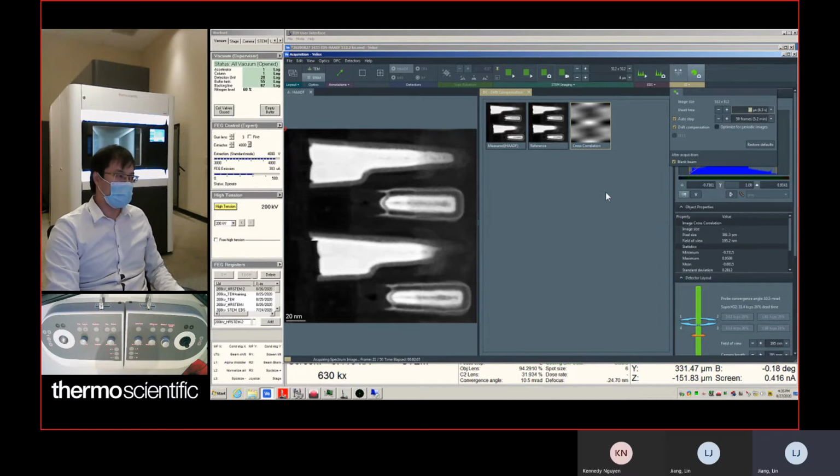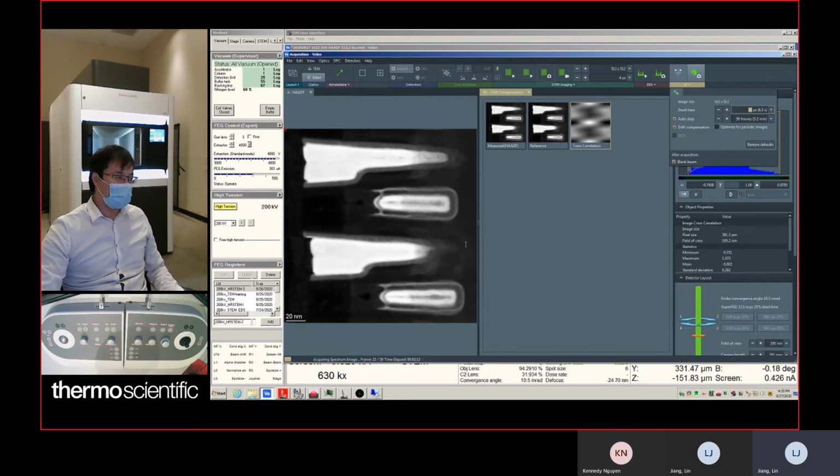For the current setting it takes about 3 seconds. It depends, because it's scanning, on at which point you move it. If you move now, it can't bring it back immediately, because every 6.3 seconds it does a drift correction.